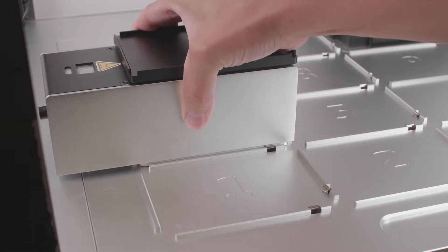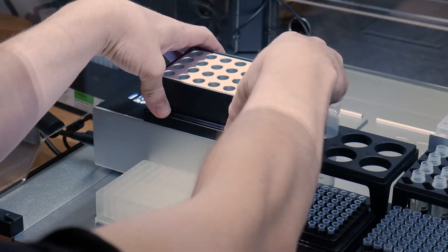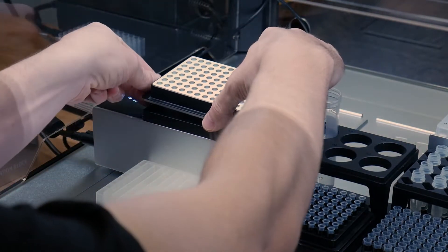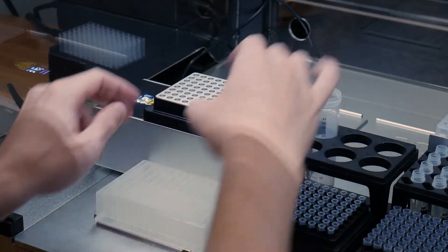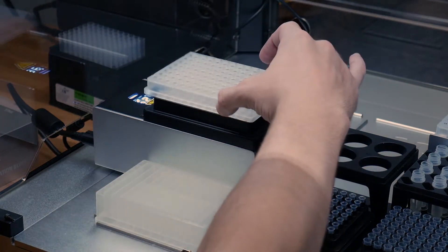The first add-on is our temperature module. The temperature module is capable of holding constant temperatures from 4 to 95 degrees Celsius. You can put aluminum blocks on the temperature module to make it compatible with anything from 2 milliliter tubes to 96 well plates.